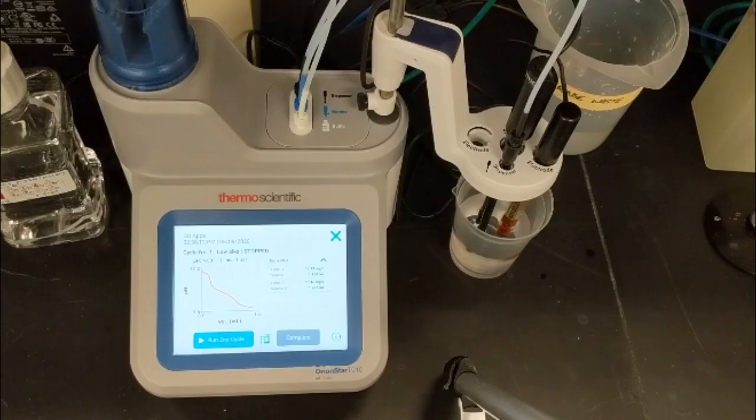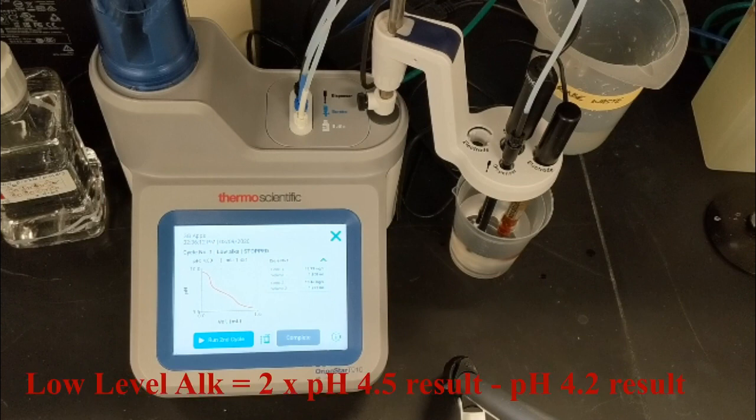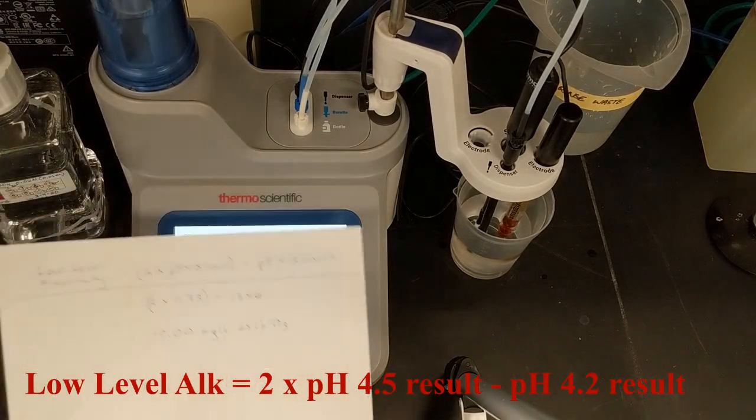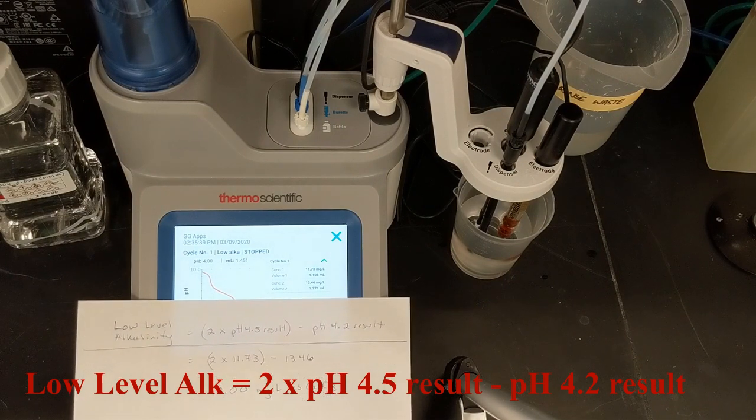When the titration is done, the results for the two endpoints are shown. From these two results, I can calculate the low-level alkalinity as 2 times the pH 4.5 result minus the pH 4.2 result.